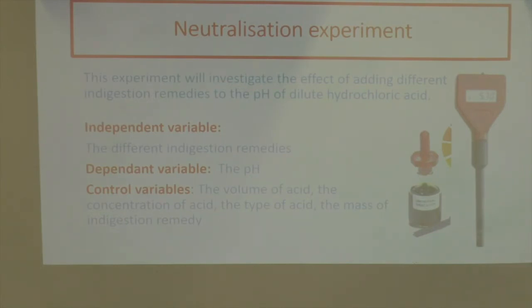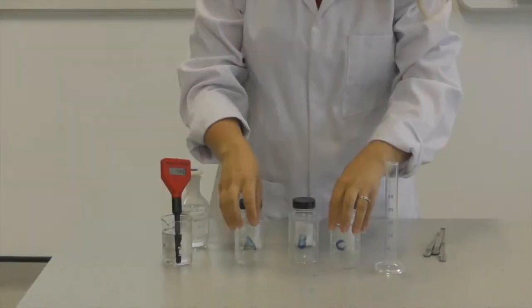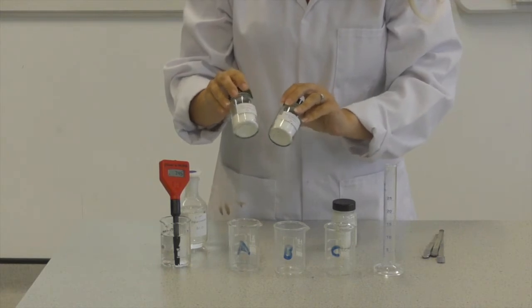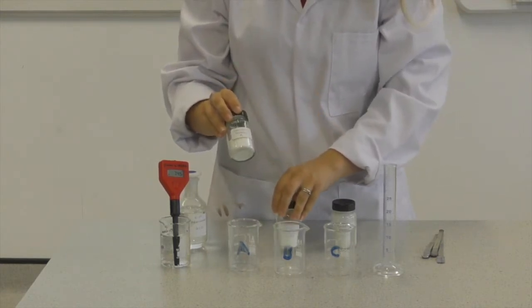Our control variables are everything else we need to keep the same so they don't affect our results: the volume of acid, the concentration of acid, the type of acid, and the mass of indigestion remedy added each time. We've got three beakers ready to test three different indigestion remedies: A, B, and C.